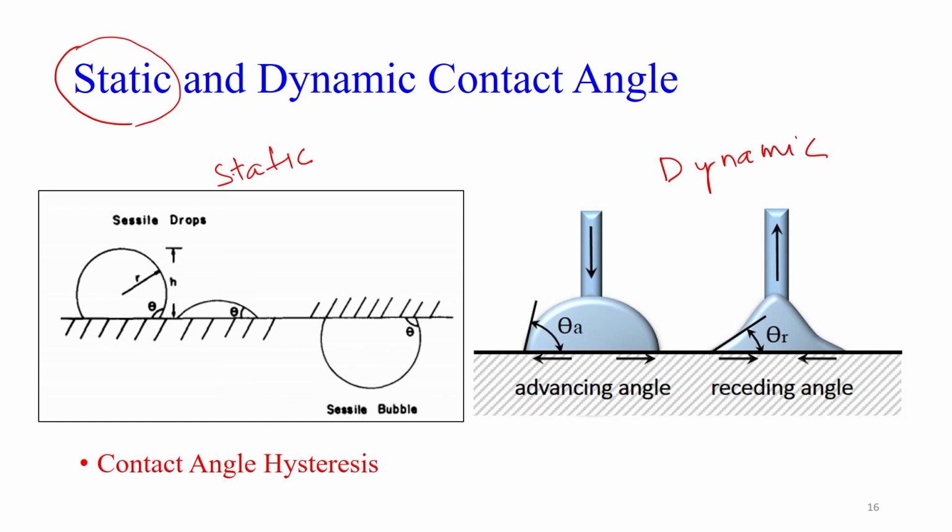There are two things we can see. First, we can see how theta is changing with time. Theta will keep on decreasing if you capture the image at different time intervals. Theta will change up to here, and this is coming because of the equilibrium.